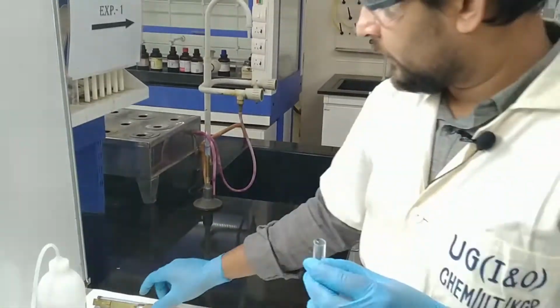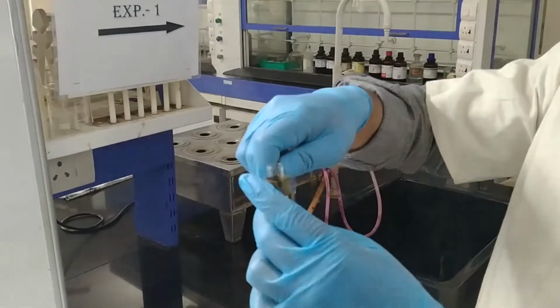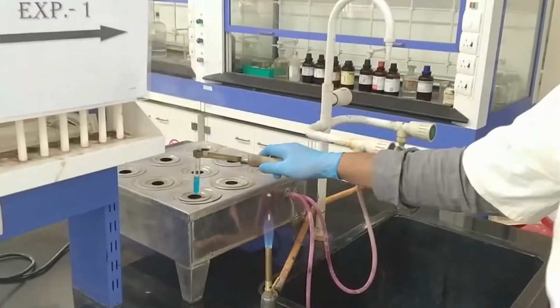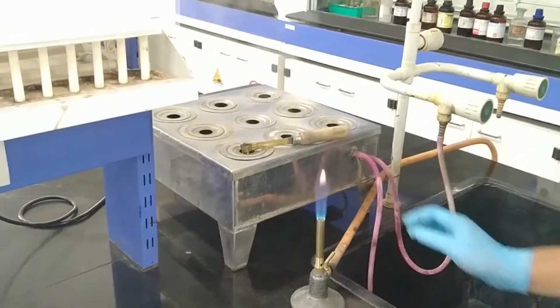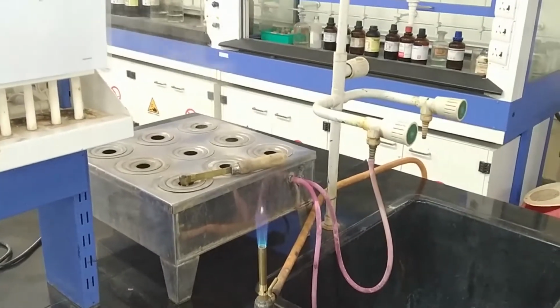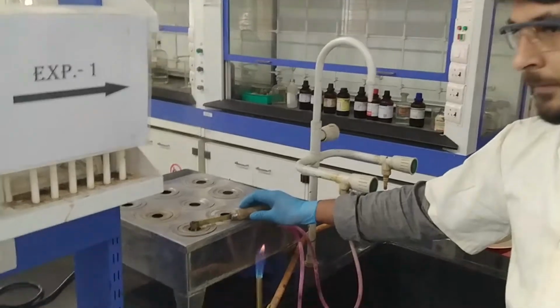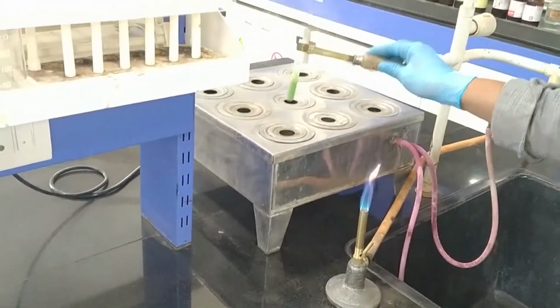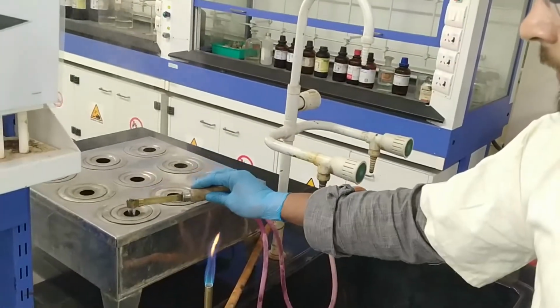Now, using the test tube holder, I just put this one inside the hot water bath, and after putting it inside the hot water bath we have to wait some minutes. So just check this one whether it's coming or not. Some coloration appears, you can see. Let this one heat a little bit more.